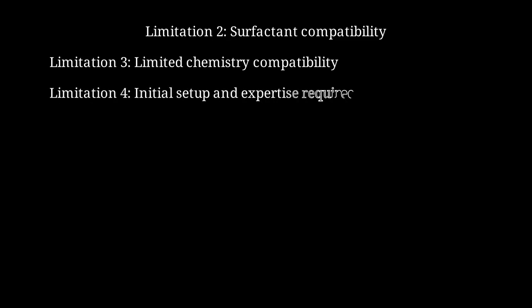Third, not all chemistries are compatible with microfluidic materials. Some organic solvents will swell or dissolve PDMS, the most common microfluidic material. Fourth, there's a learning curve. Setting up a droplet microfluidics system requires expertise in microfluidics, optics, and often some custom fabrication.